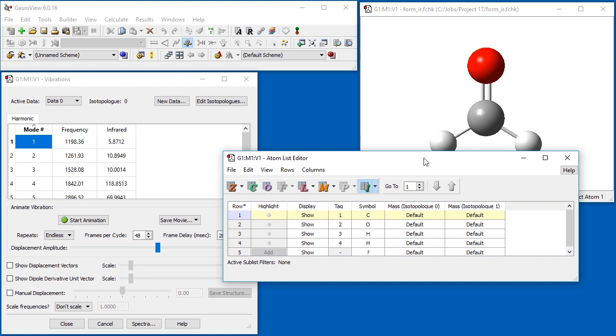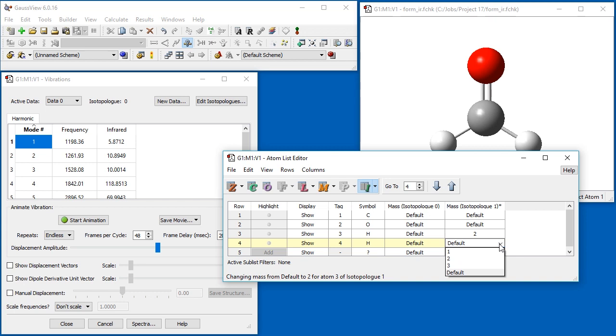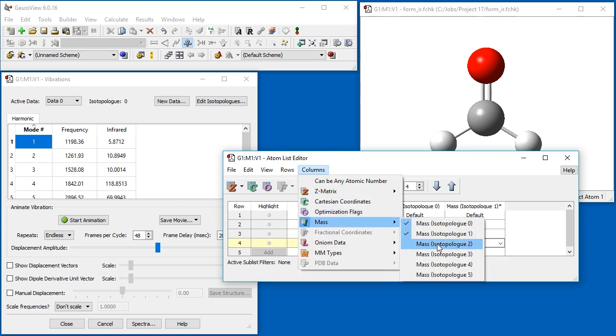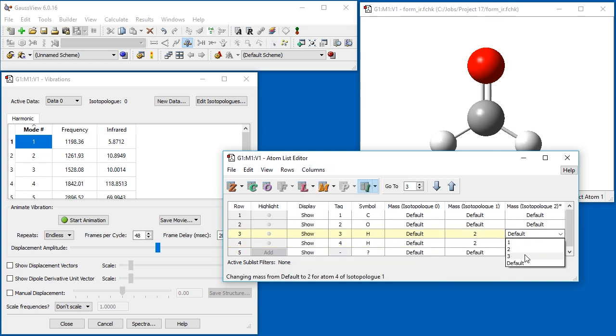GaussView automatically adds a column for an additional isotopologues, here isotopologues 1. We specify an atomic weight of 2 for both hydrogen atoms using the pop-up menu in each cell. Additional isotopologues can also be defined directly by enabling another item on the column mass submenu.